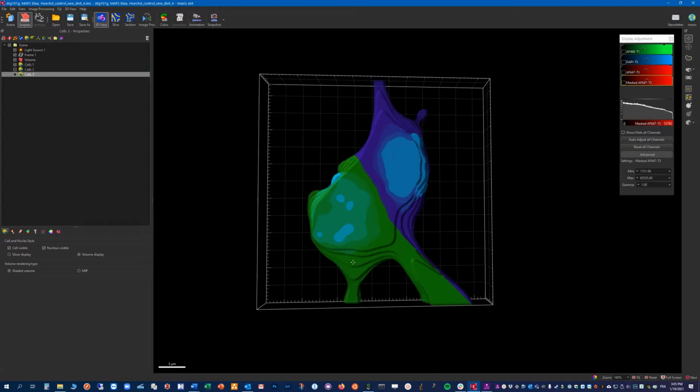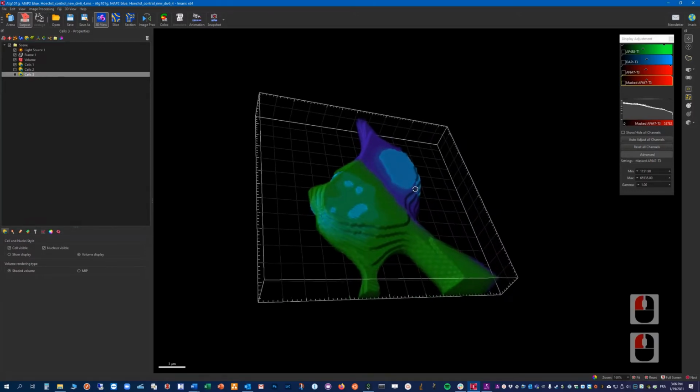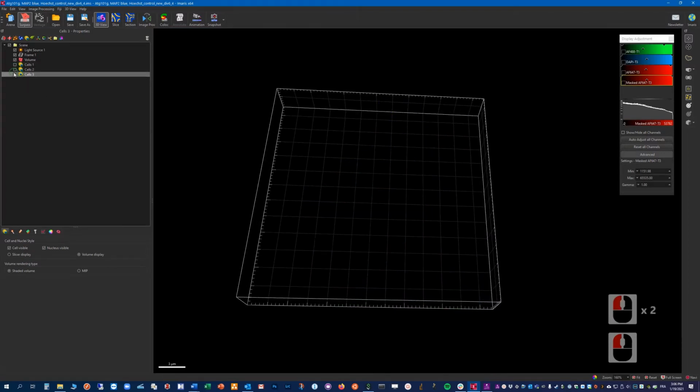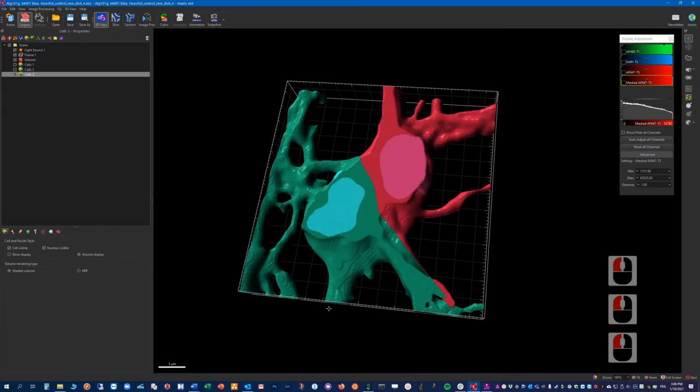And you can especially see here the scale effect due to the only 7 slices we had in the Z direction, while here we have a much more precise result.